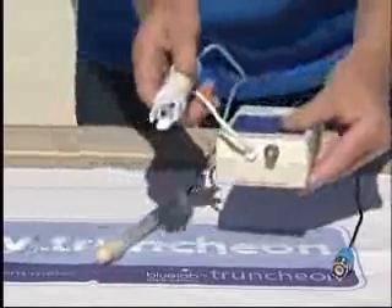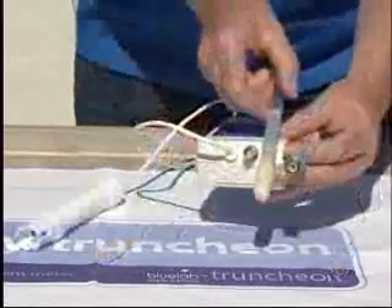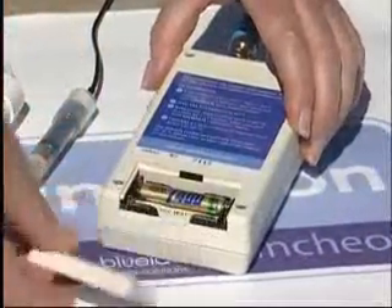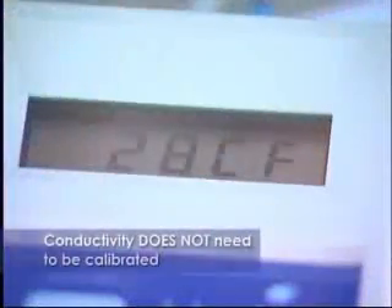The conductivity probe is permanently fitted to the main unit but the pH probe supplied has a BNC connector for easy fitting and removal. The combometer is designed to be manually switched on by pressing any button but comes with an auto-off feature, maintaining the integrity of the batteries for as long as possible.